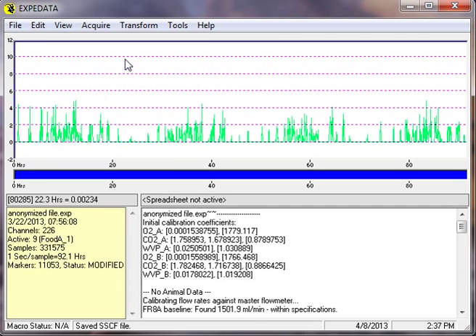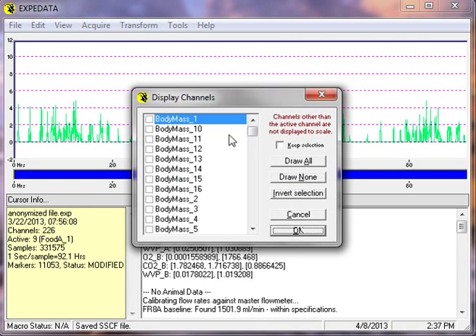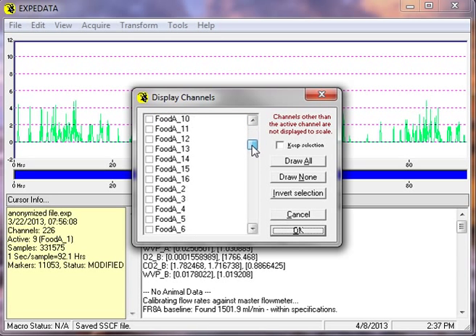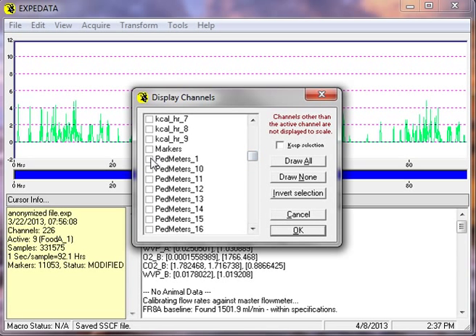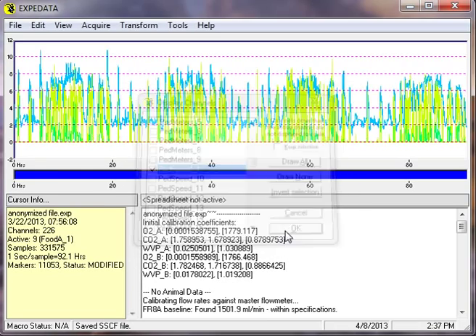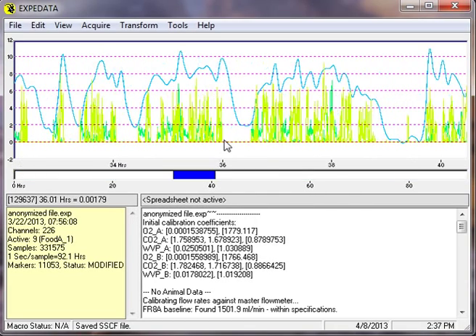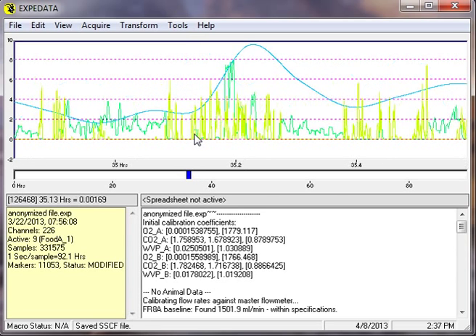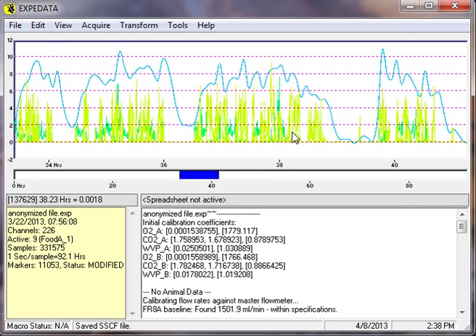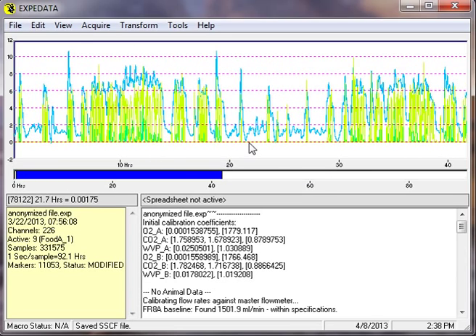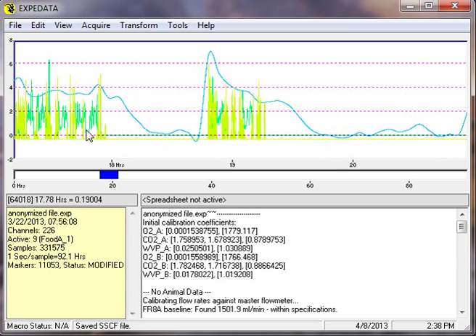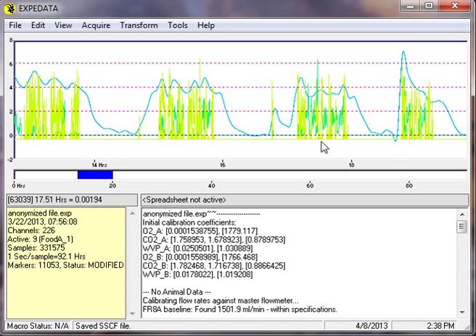Now, let's go ahead and draw, or display, the kilocalories per hour. So we click that box. And the pedestrian running speed, also for that animal. And here you can very clearly see how the animal is alternating between running and feeding. The darker green here corresponds to feeding. So really, the energy expenditure trace corresponds to more or less a summation of the energy expenditure associated with running and the energy expenditure associated with feeding.